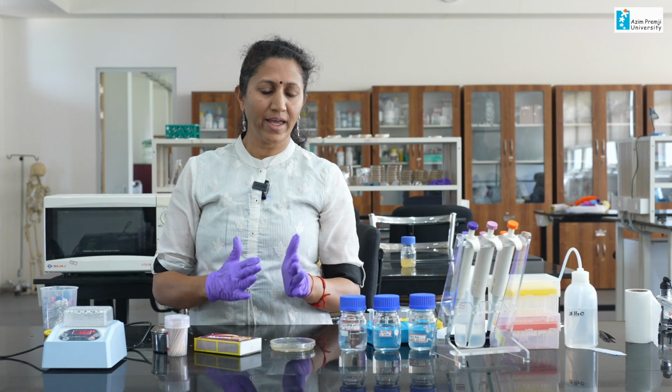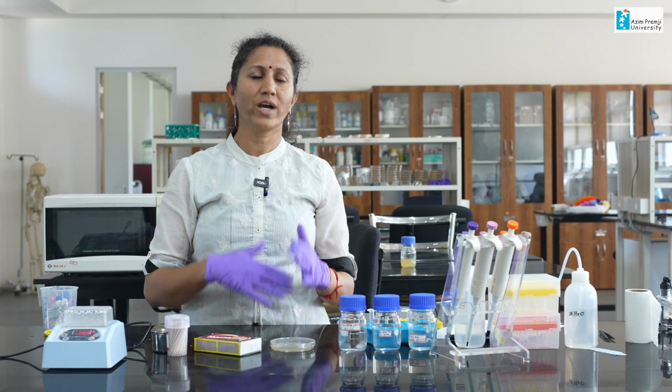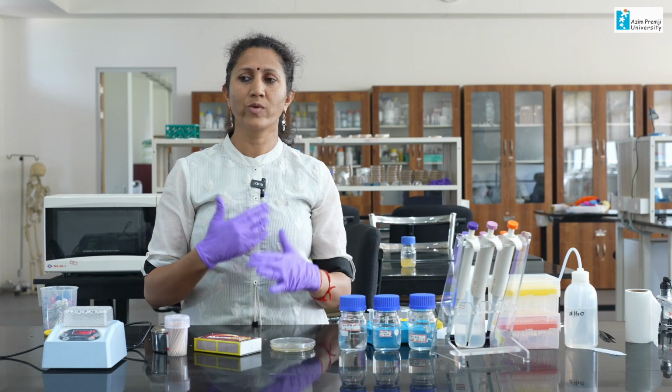The protocol, the steps that you follow, is not the same for all samples; it depends on what sample you are going to take. If you are taking a complex tissue like plant or animal tissue, then you have multiple steps, like various purification steps. But when you use single celled organisms like bacteria, prokaryotes, you do not need that much purification. So, it is a simple process.